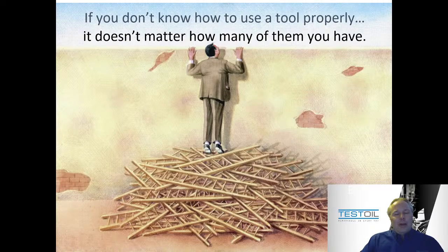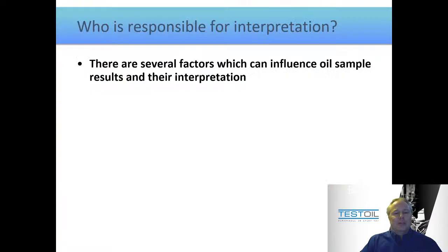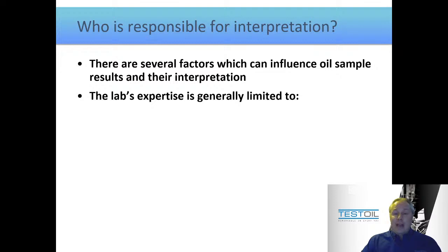And one of the things I like to point out about why it's important that people understand how to read a report at a greater depth is to ask another question. And that question is, who is ultimately responsible for interpreting an oil analysis report? Of course, many people put that squarely on the shoulders of the lab. And they say, well, that's what we're paying you for. Well, you're paying the lab for quite a few things, actually. You're paying the lab for accurate numbers. That's first and foremost what you want to get out of your money. What you're asking them as a favor almost is to offer you a high-level interpretation of those numbers based on their experience. Because what I think you have to consider is that the lab's knowledge is very limited.